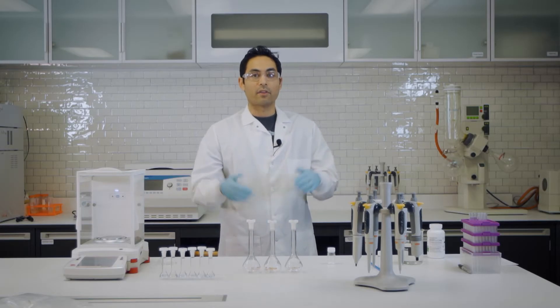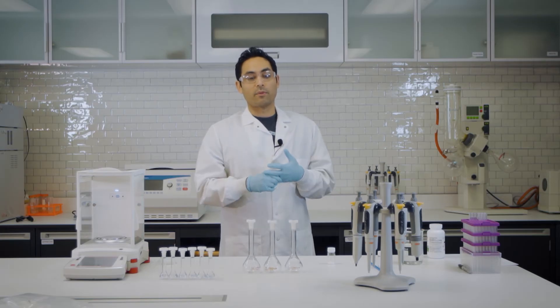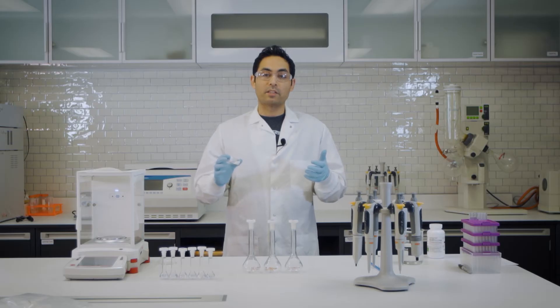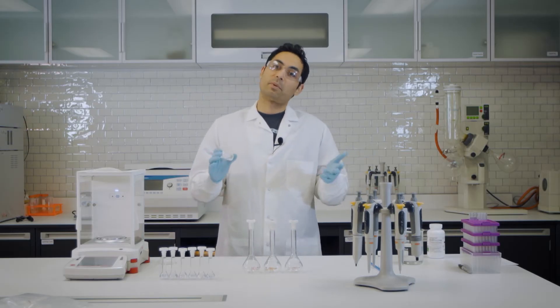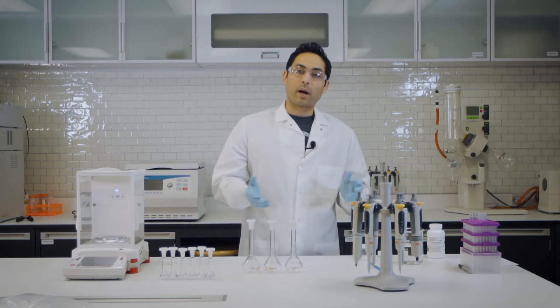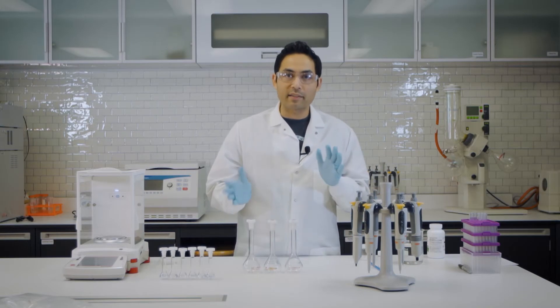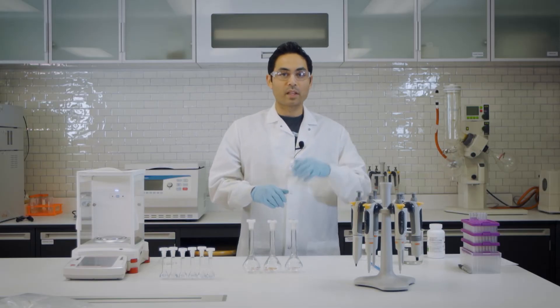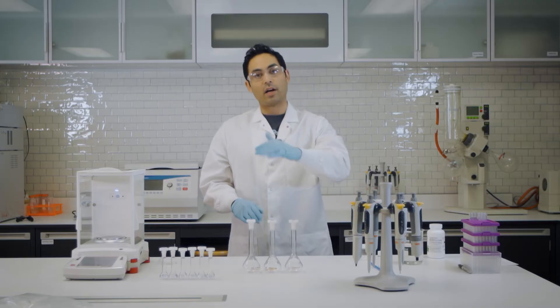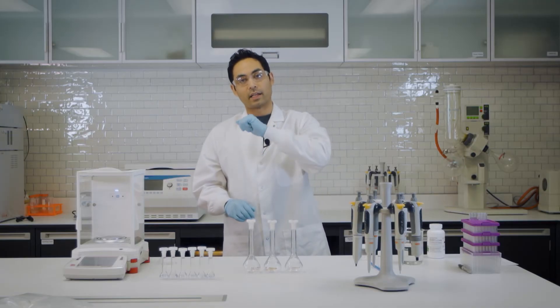So how do we build a cal curve? The first thing we want to start with our NEAT standard. NEAT pretty much means pure. A pure sample would be a million parts per million and you usually go to a stock solution. Our stock solution would probably be somewhere around 2000 ppm. And from there it'll be really easy to dilute out to your 200 and 100 and so on.